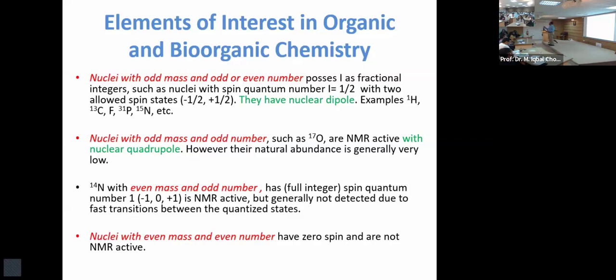And that is the reason why I said this is the science of weak forces. You need to have a super sensitive detector in order to measure absorption in a fraction of a calorie. Fraction of calories, right?